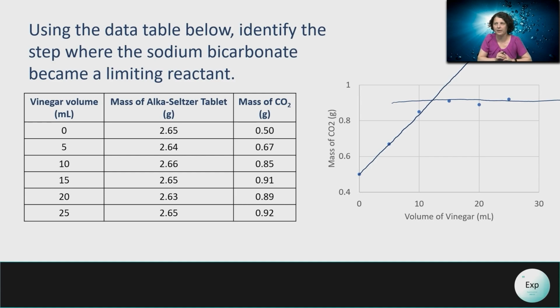And that's about there. If there is no more sodium bicarbonate to react with, the reaction stops regardless of how much acetic acid there still is left over to react with it. And we can easily tell if we simply test the pH of our solution, and we're going to see increasing acidity or decreasing pH with excess amounts of acetic acid being added.